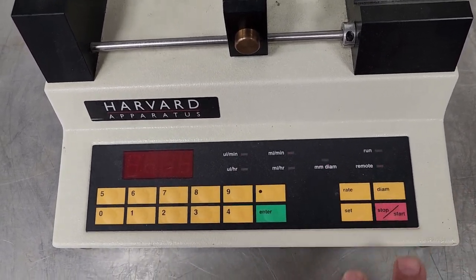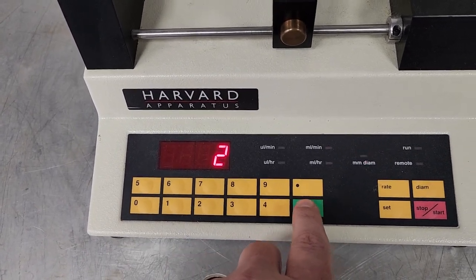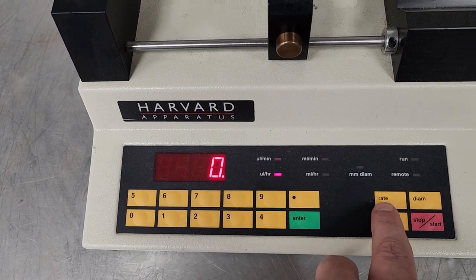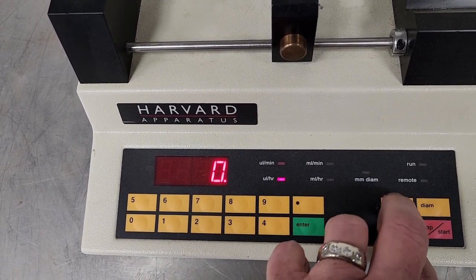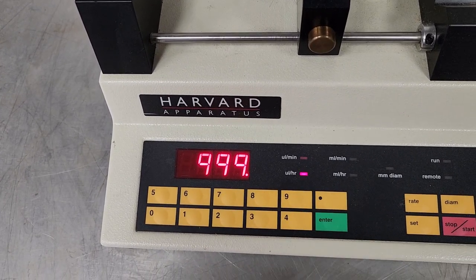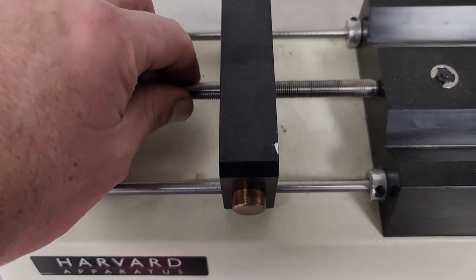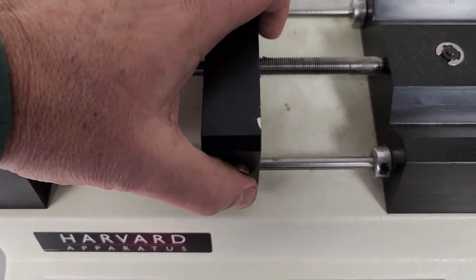Set diameter. And we're going to go 2. Push enter. And then we're going to go rate, set rate, and we're going to go 999. Hit enter. There you go. So, yeah, now that's going much faster.